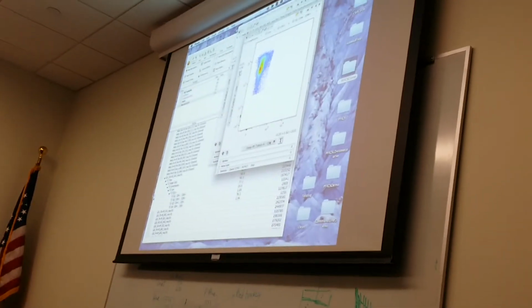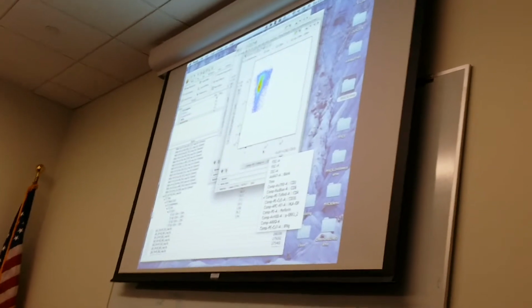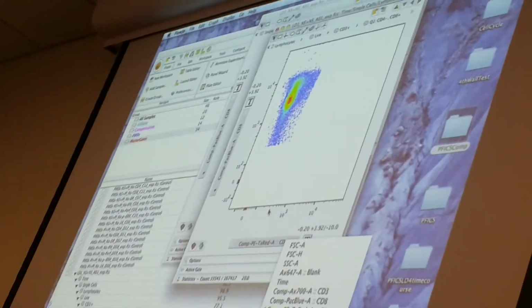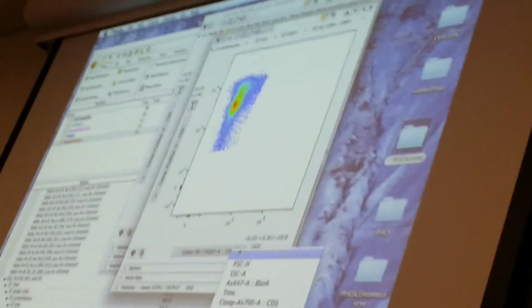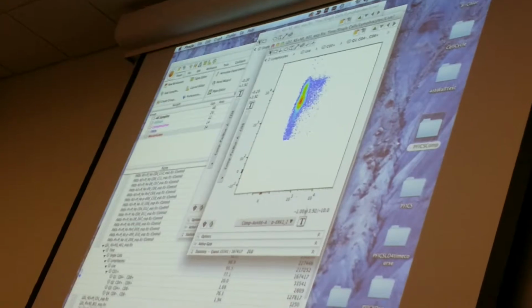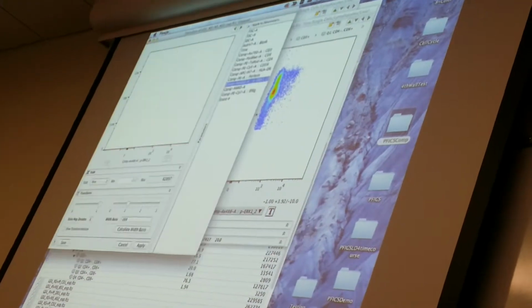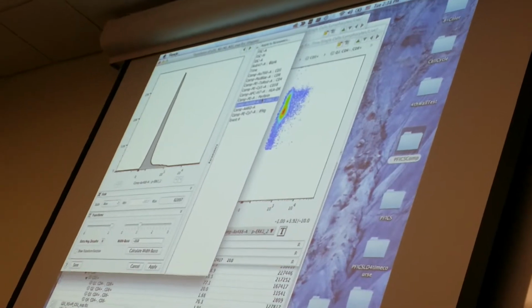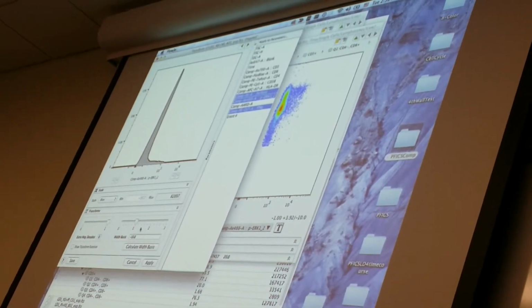Now I'll gate out markers one by one in the CD8 positive T cell population, because these are the cytotoxic T cells that I was interested in focusing on for my functional assay in the clinical cohort. And so I'm going to go ahead and just change this to ERK. In this case, I know that I want to actually reduce a little bit of the space here. So I'm going to go ERK, perforin, and interferon gamma. Those are my three functional markers.